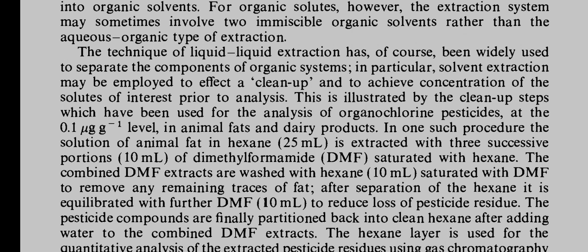at the 0.1 ppm level in animal fats and dairy products. In one such procedure, the solution of animal fat in hexane (25 ml) is extracted with three successive portions (10 ml) of dimethyl formamide (DMF) saturated with hexane.